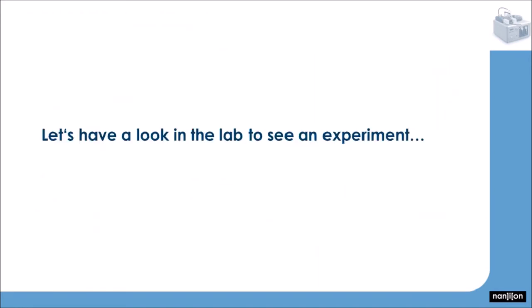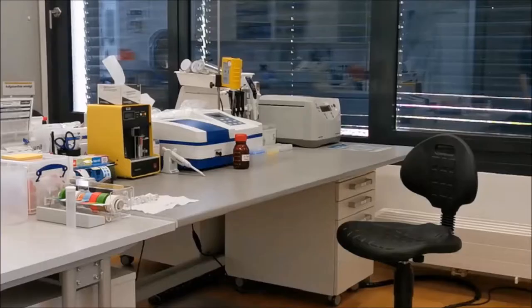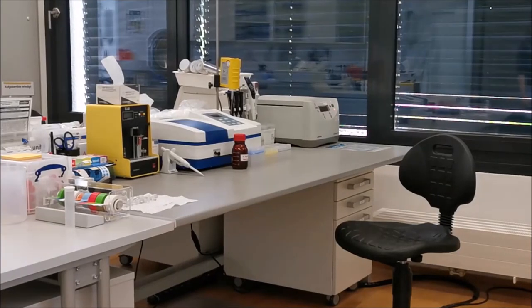Now let's have a look at the instrument in the lab. We prepared a little sequence to show you the whole workflow, including the sensor preparation and the final results. So for this demo, we chose to show you PEPT1, a proton-coupled oligopeptide transporter expressed in CHO membranes. So my colleague André will guide you through this now.